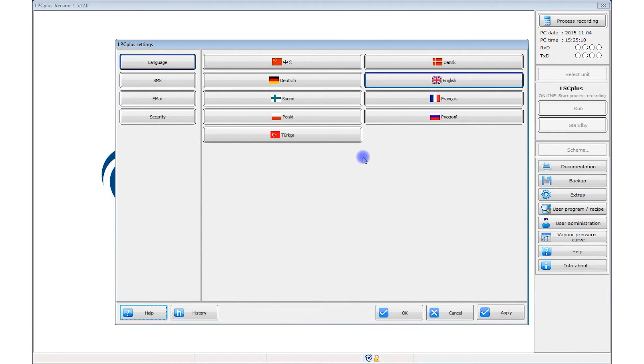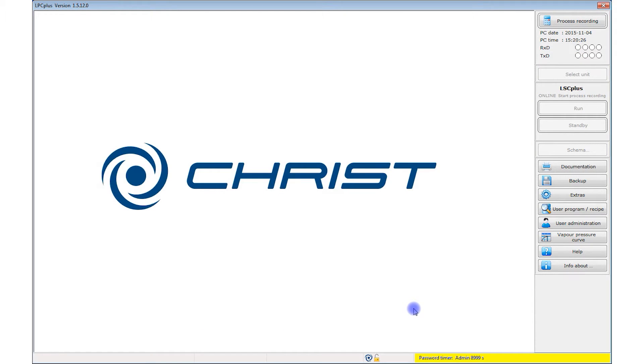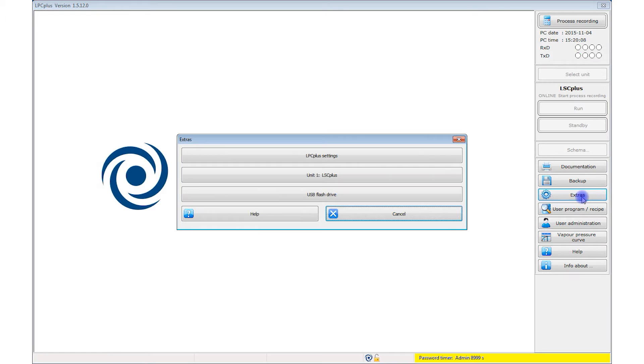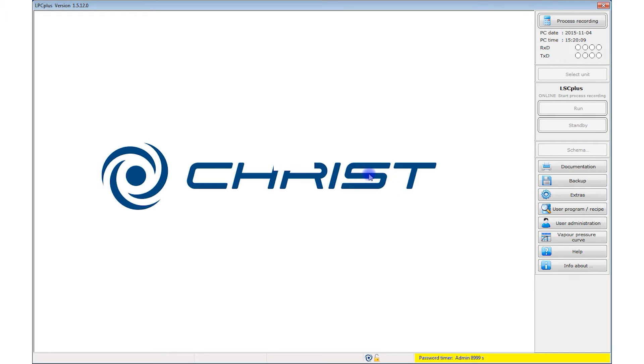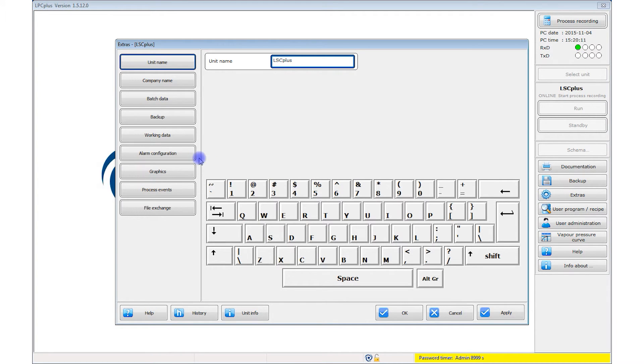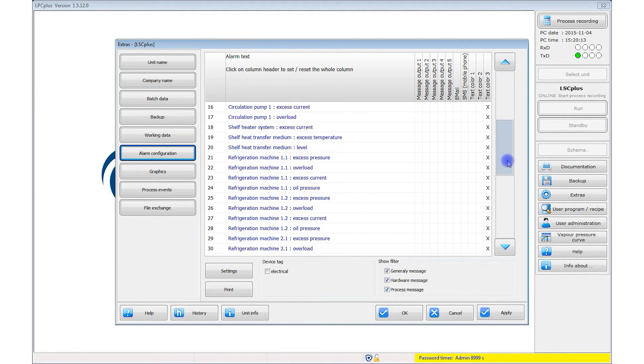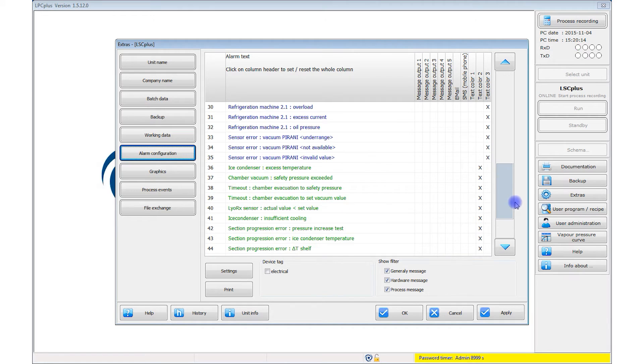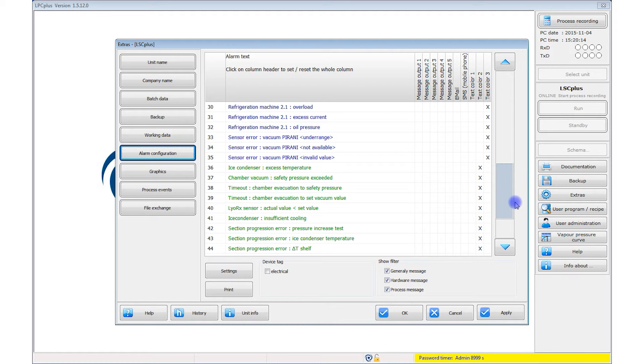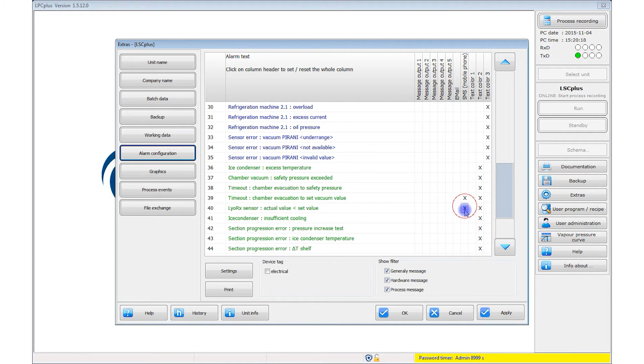The freeze drying process usually takes a very long time. For many users, it is important to receive messages or alarms immediately, also when they are not in front of the freeze dryer. That is why we integrated user configurable messages and alarms in LPC plus. For example, you can be informed immediately by text messaging on your mobile phone or via email when the process has completed normally, or when it is halted due to an alarm. This can easily be configured in the settings window. Emails or text messages can be sent to various receivers.